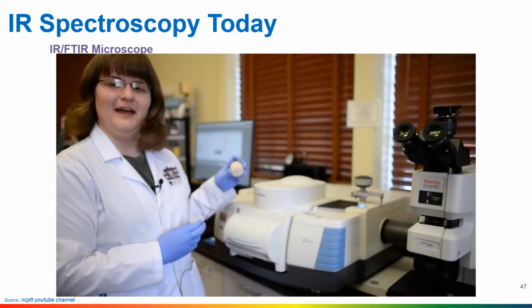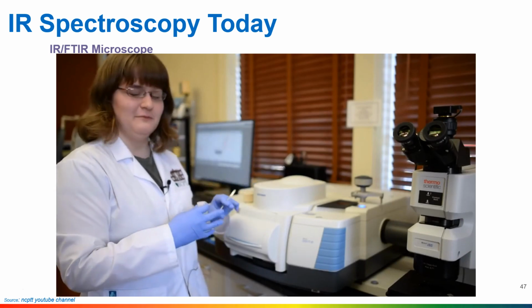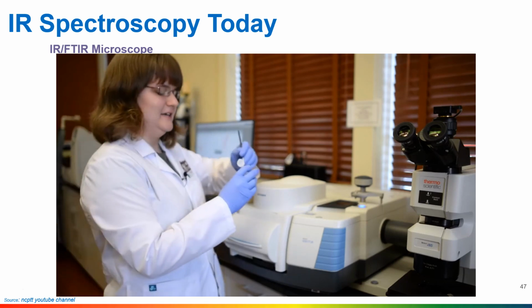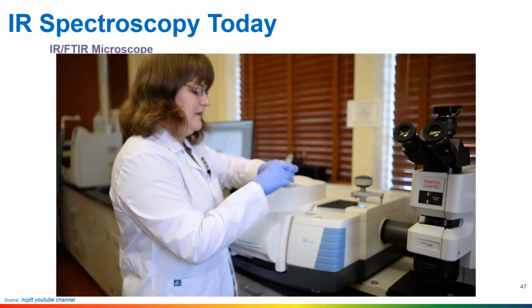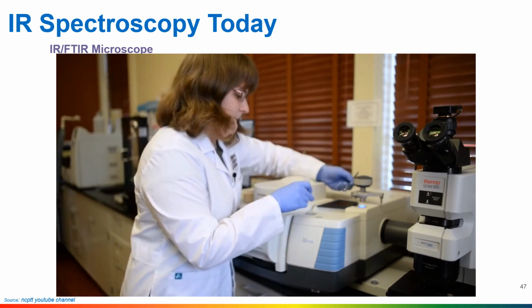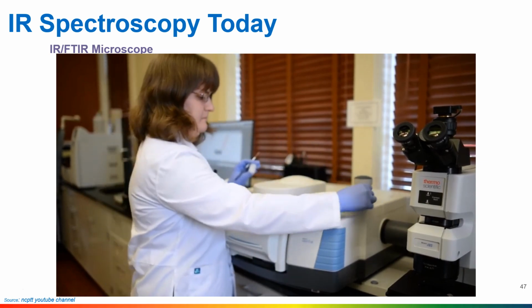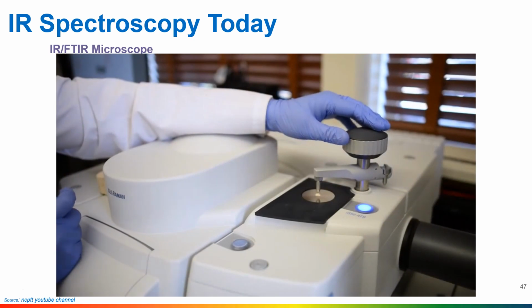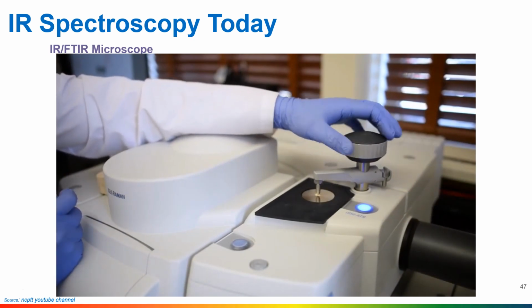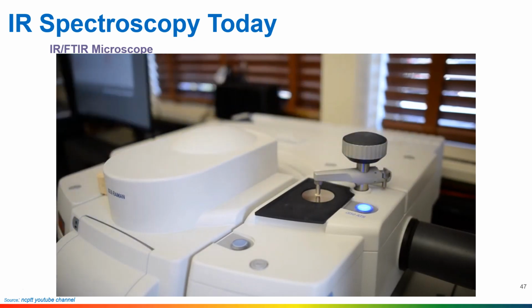So I'm going to be showing you how to use the ATR with this limestone sample that I have here. Like I mentioned, when we have a solid like that, we typically powderize it. So I've got some powder that I collected earlier in here. And it doesn't really take much. Close this handle right here, so basically we're now ready to take the IR spec, so that ensures that we have contact of the powder with the crystal itself.